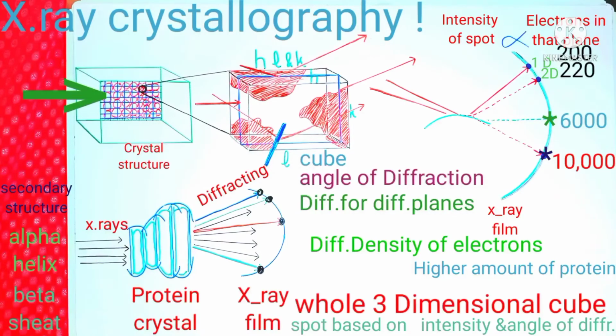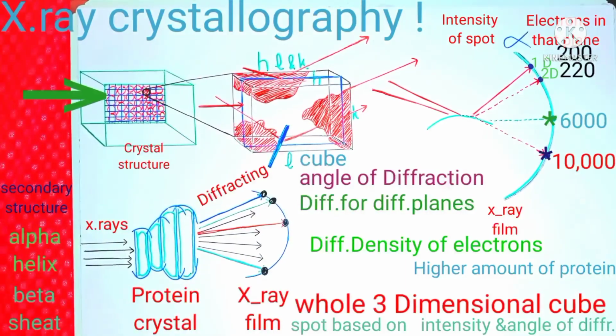Now that is also not the end. That is again a crude idea. Now we take advantage of other computerized biotechnology tools, like the bioinformatic tools. We take the Protein Data Bank, and we take the same type of protein structure. We compare this structure with each other to find out exactly where there is a difference or a change, so that we fill the gap between our idea and the information from the database.